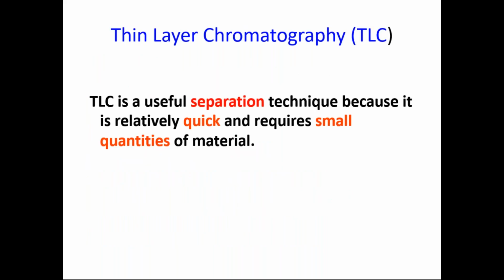Now coming to thin layer chromatography, which is very similar to paper chromatography, but here the stationary phase is not the thin paper, but it is a thin layer, and it is a very useful separation technique.